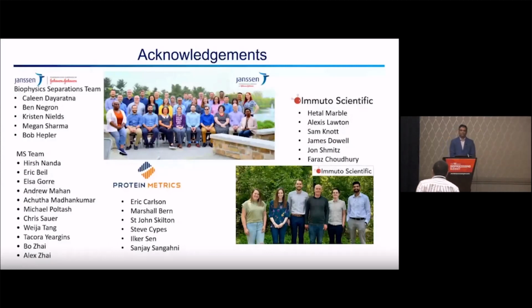Great talk, thank you. I've got colleagues at the University of Leeds doing fast photochemical oxidation of proteins with hydrogen peroxide who dream of being able to get their end products in 1 to 2 days. It's taking them months to analyze the data. Are you aware if the Protein Metrics software can cope with hydrogen peroxide-based radicals, or do they have to stem from plasma or synchrotron radiation? Yeah, absolutely.